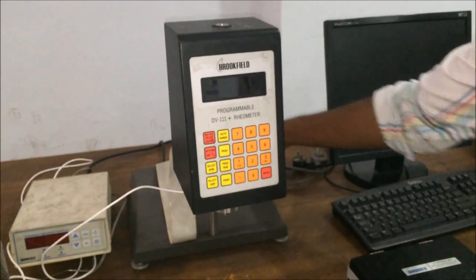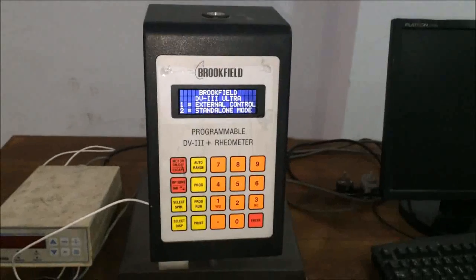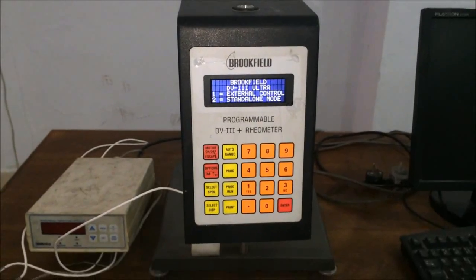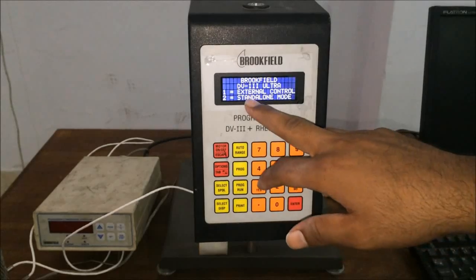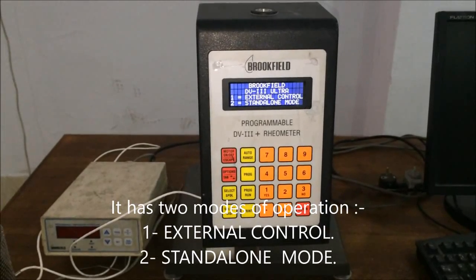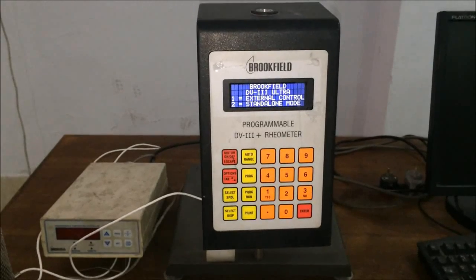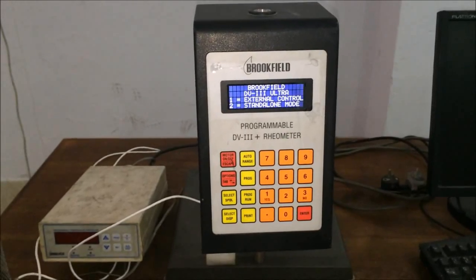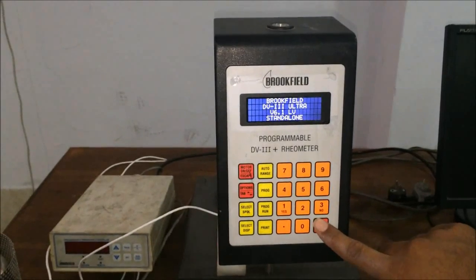I have now turned on the machine. On the screen you can see the machine allows operation in two modes: the first is the external control mode, which is software-based, and the second is the standalone mode, which we are choosing because we are performing our experiment manually. I will press the second option and then press enter.